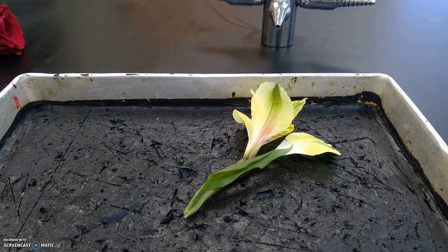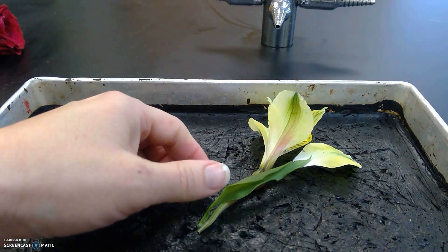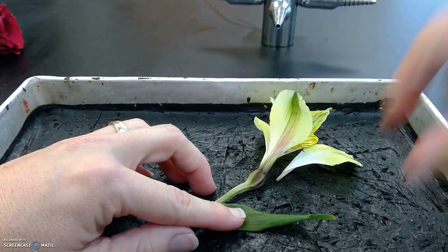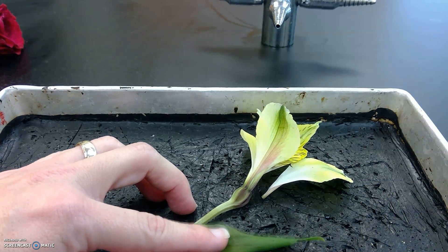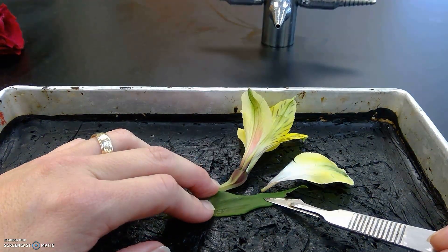Hi guys. I thought I would do a dissection of a flower for the sake of our online learning. We've learned a couple things already that I wanted to review. First of all, angiosperms are our flowering plants, and we're going to look at two flowering plants today. We've also learned that angiosperms can be divided into monocots and dicots.